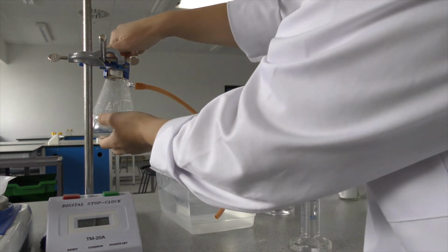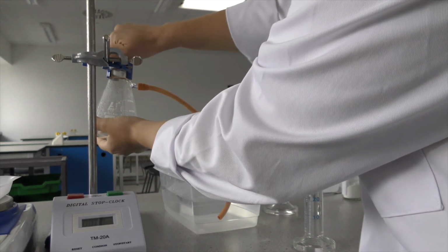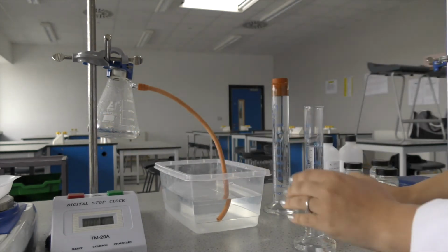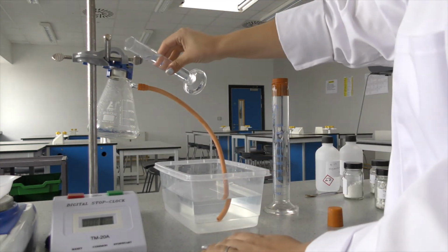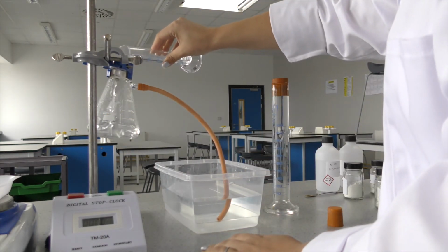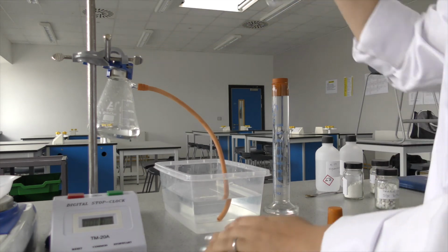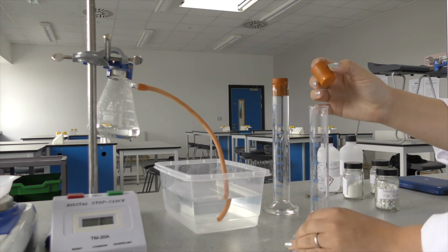And I'm going to add it into our conical flask that's set up ready for us. This is our first reactant, our hydrochloric acid. So we would use 50 mils of the same hydrochloric acid each time.